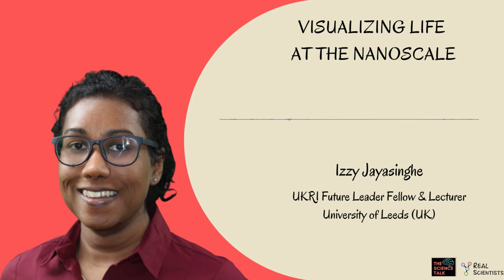And I guess when you develop these techniques, you apply them to interesting questions. Generally, the questions tend to be biological. So you try to apply them to visualizing structures inside cells or tissues and understand from the pictures that you get from applying that method how life is orchestrated in that spatial scale.